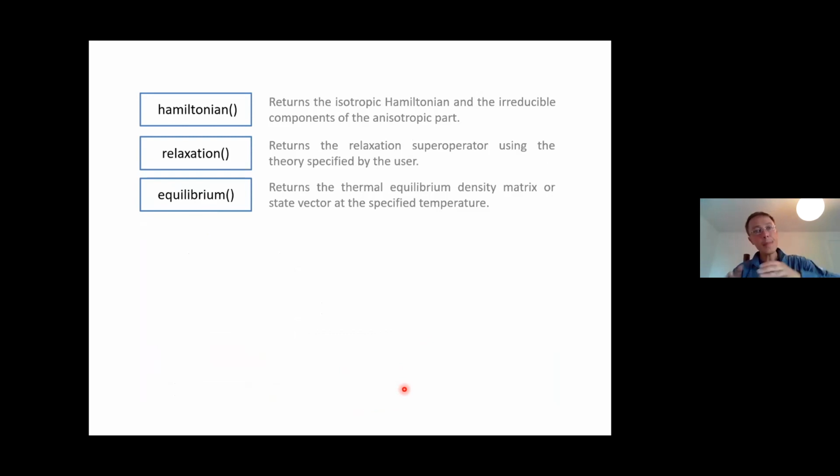And then the roads diverge. On the one hand, SPINACH is written to service a sizable community of super experts, like the people at the cutting edge of the development of magnetic resonance itself, who would need every little nitty-gritty and every individual operator.